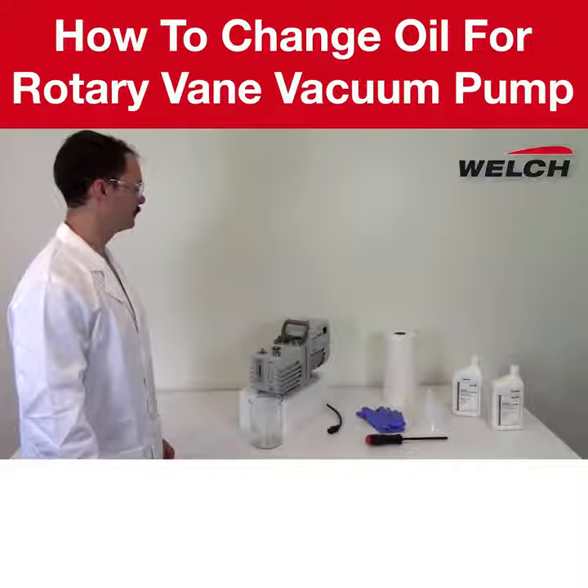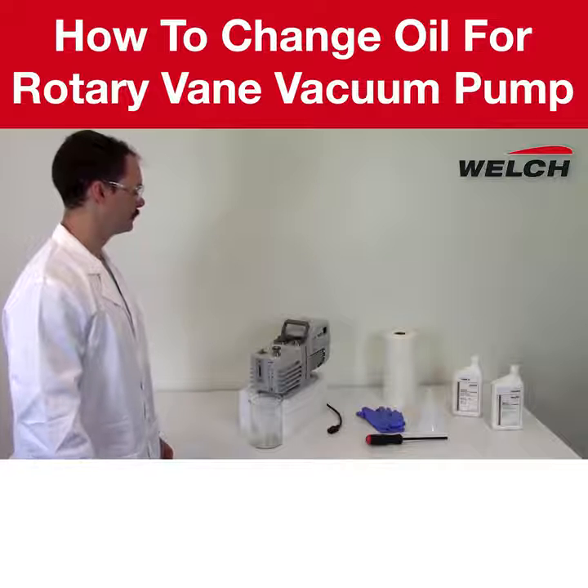In this video, we will show how to change the oil in an oil seal rotary vane vacuum pump.